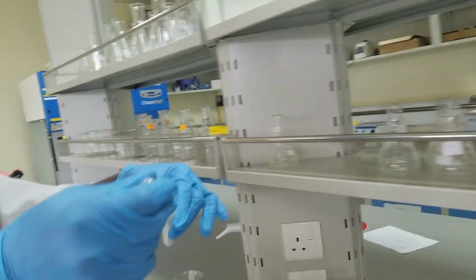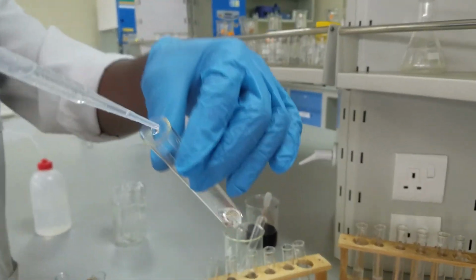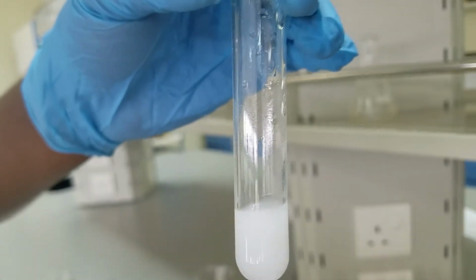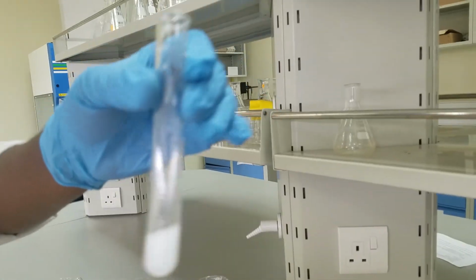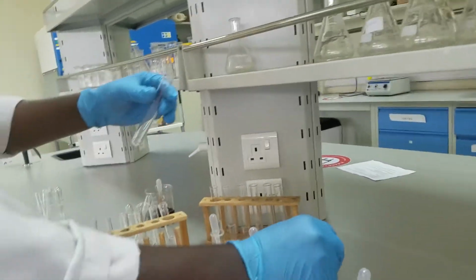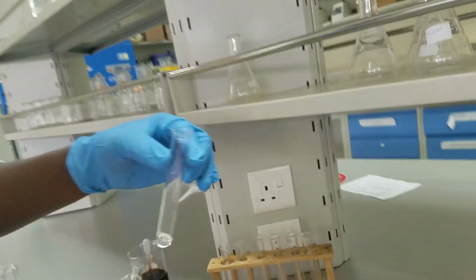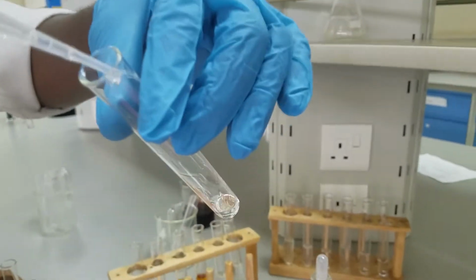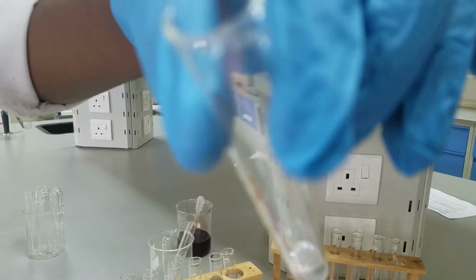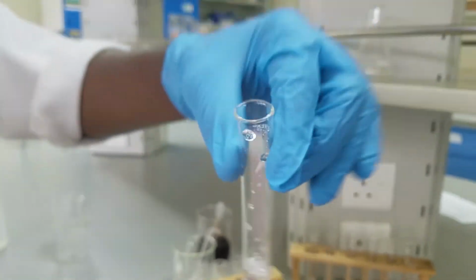Next part is acetone. 5%. Look at that. That is acetone. Then we go to acetic acid, and then add the 5%. Take note of what is happening.